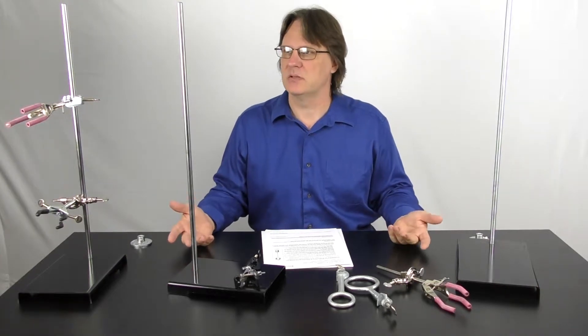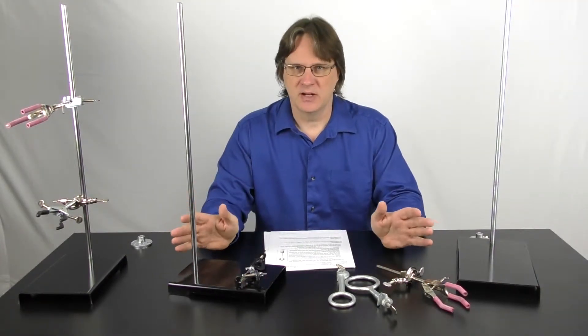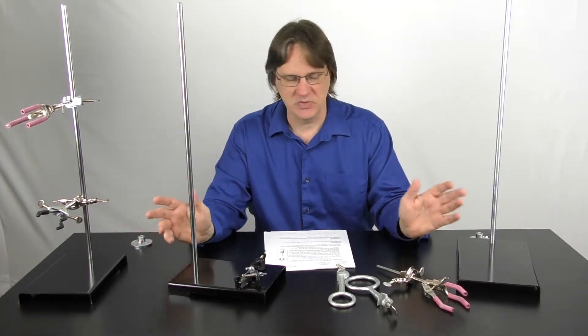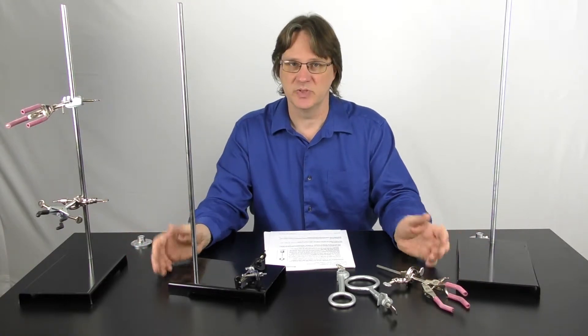Hey guys, where's my other support stands? This has happened to everybody in the lab. You're trying to set everything up and you can't always find the stands because someone borrowed them.